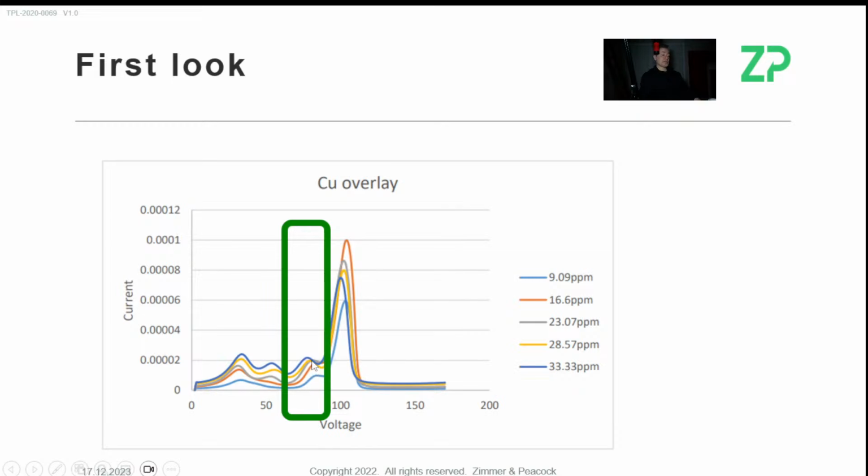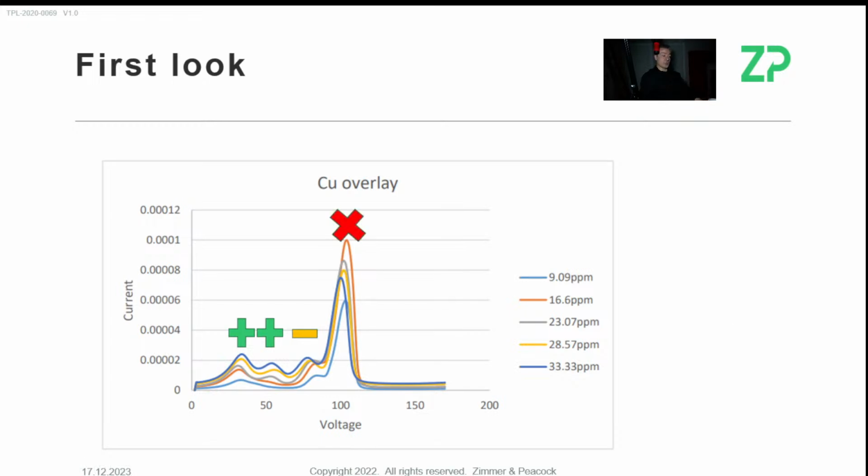Highest is highest concentration and lowest concentration is lowest signal, but in the middle it gets a little bit more mixed up. Then, when we go to peak 4, which is this last one at about 100 millivolts, that's when it does break down. I've labeled it up here: that peak works, that peak works, that peak starts to get a bit borderline, and that peak doesn't work. So I think what you're having here is that you're oxidizing copper in essentially 4 events.